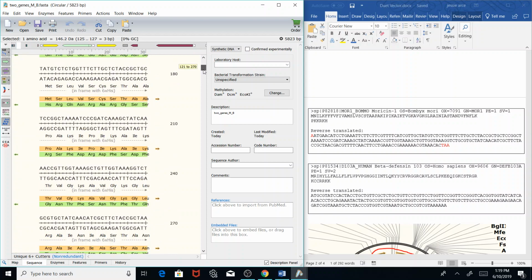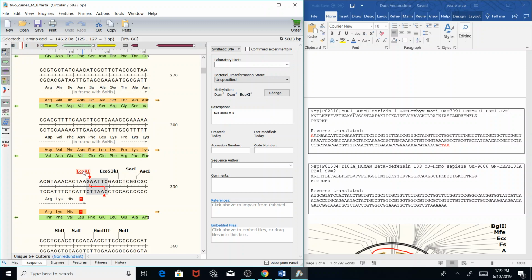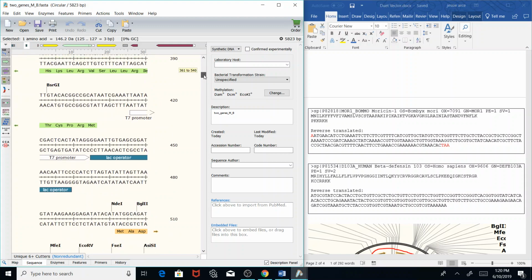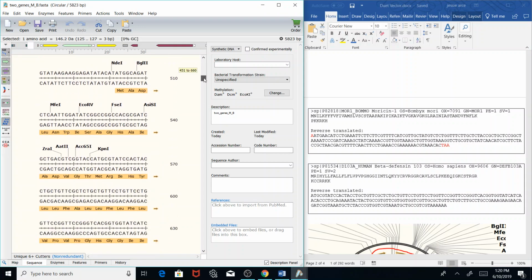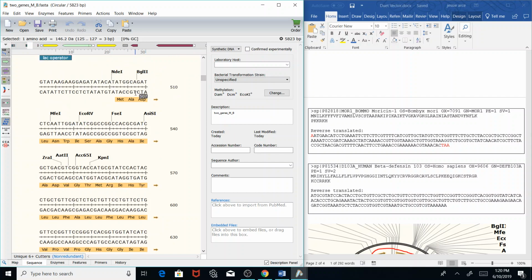You can scroll down to where we have EcoRI. Remember, we added a stop codon here. Here it is, stop codon right here. So that means it should be histidine, lysine, arginine. Okay, so we're good so far, but we're not in the clear yet. We need to double check and look for our second reading frame right here, or check for our second protein, to see if it's going to be coded here.